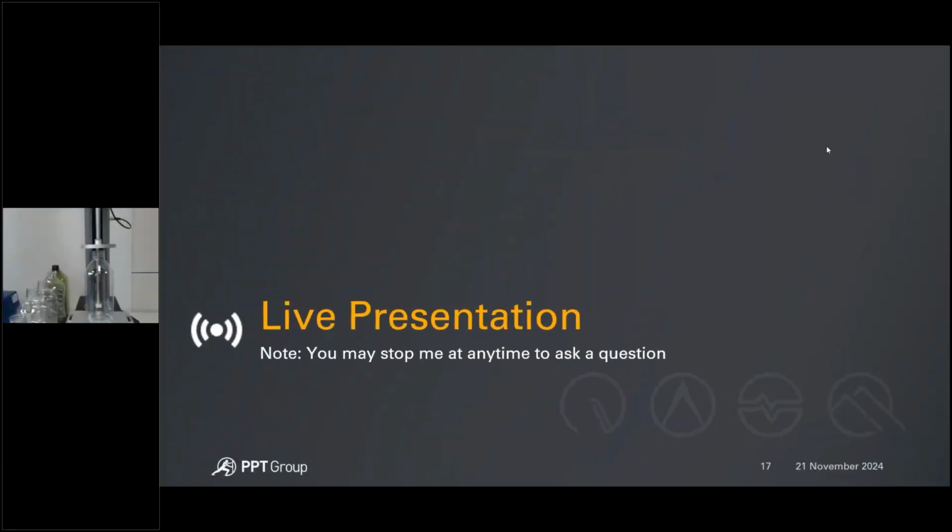So first, this is what the test looks like. So the test is being run on a software-driven OmniTest 2.5. We have an oversized base plate to accommodate the different sizes of containers we're testing. Now, again, for purposes of our webinar, we're essentially just going to look at different sizes of bottles and how they react under compressive load.